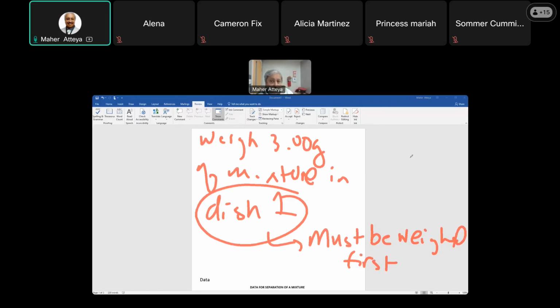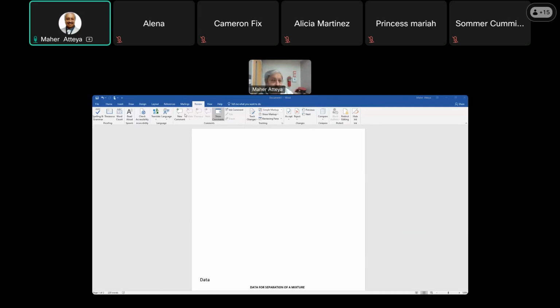Your setup will be looking, as you see it in the hood. The setup is made of a stand. This is a stand here.